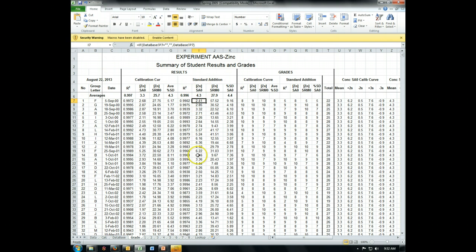We know about the average concentration that we're finding of zinc. This is going to be a low concentration. We'll see units in a second. And then for our standard reference material, you can see it's a higher concentration. And also our standard addition method is giving us somewhat comparable numbers to this first column, though it's not a shock that we're seeing differences because this is a group of students who is just learning the topic.